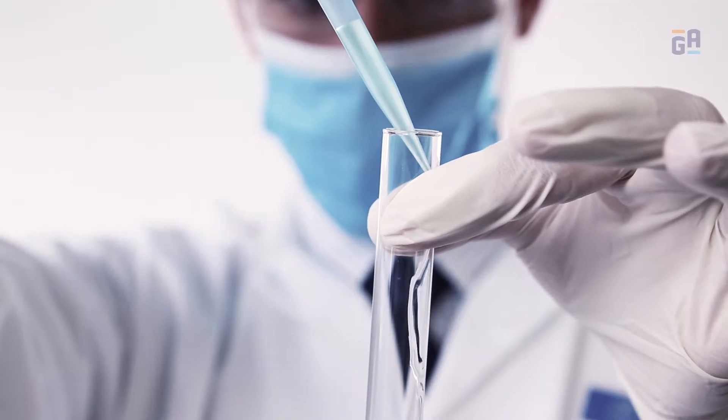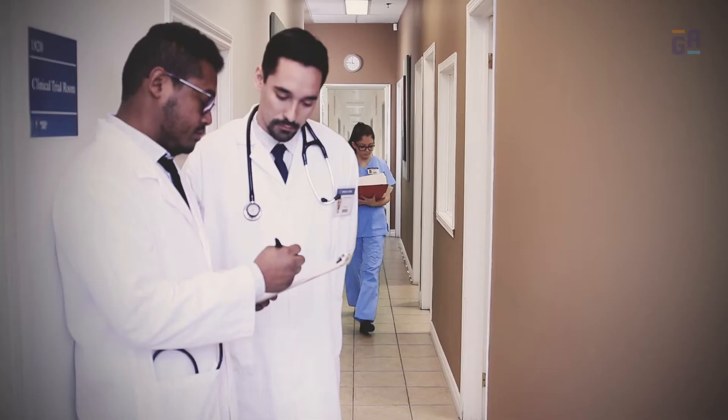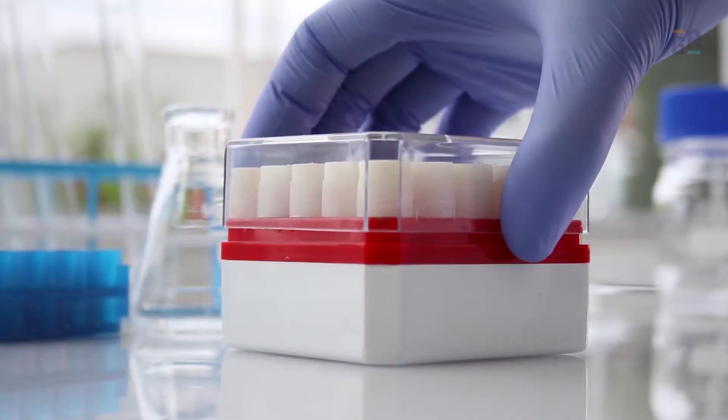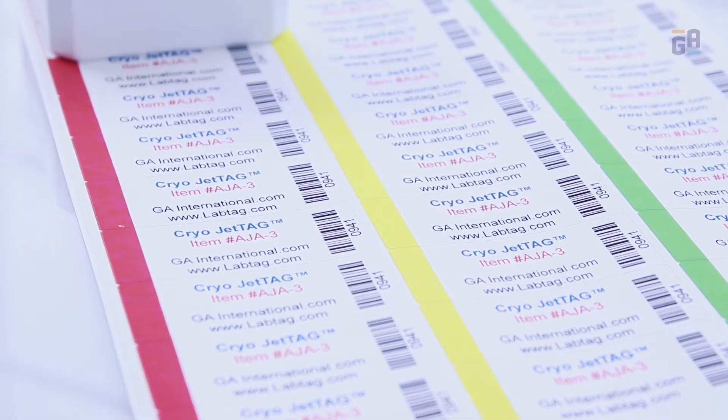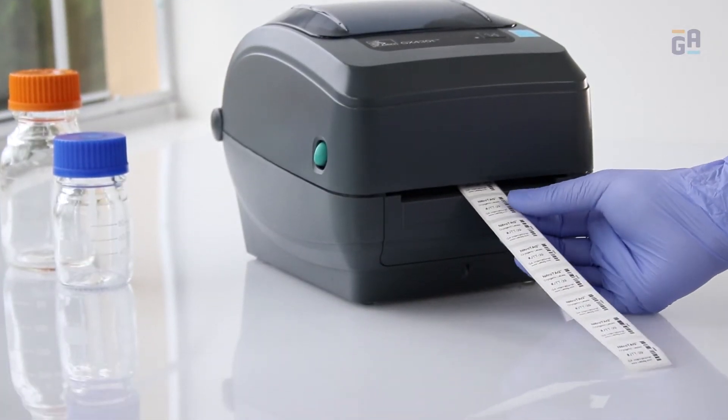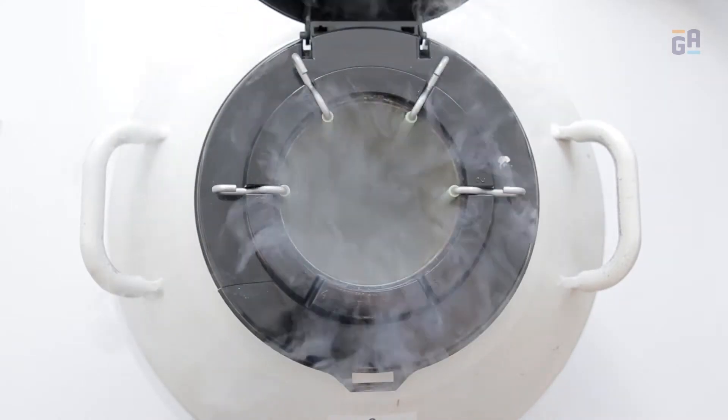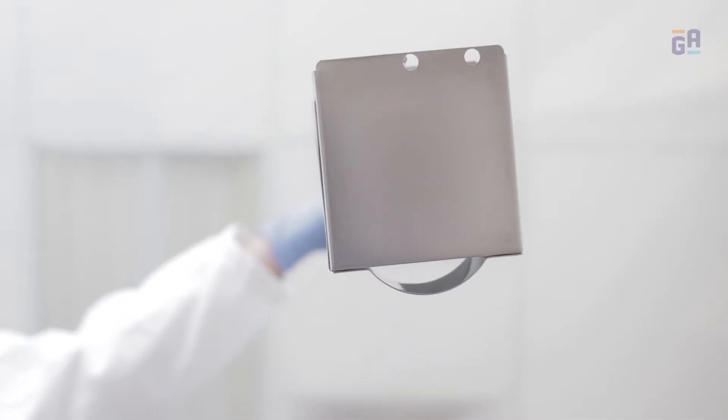Lab supervisors and managers, have you ever wished you had at your disposal an affordable, comprehensive labeling system to identify samples stored under cryogenic conditions without worrying about their performance?